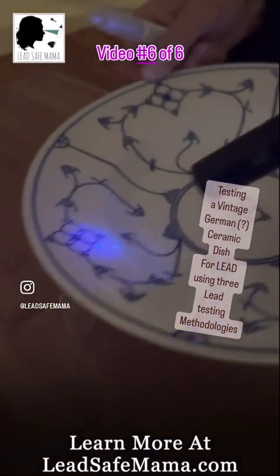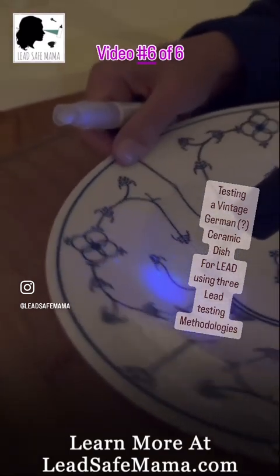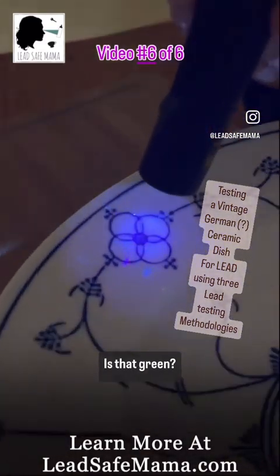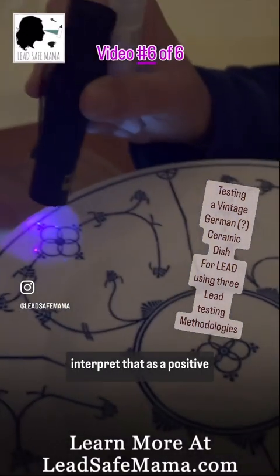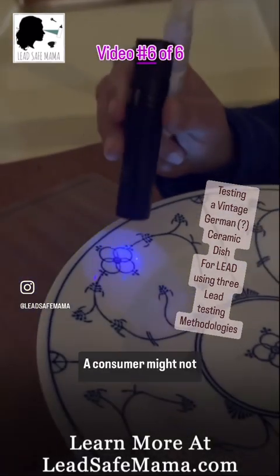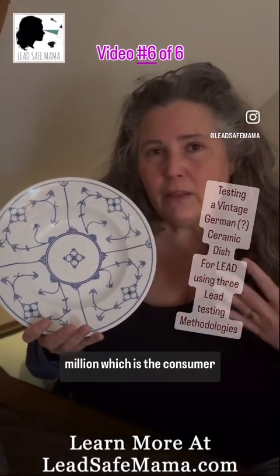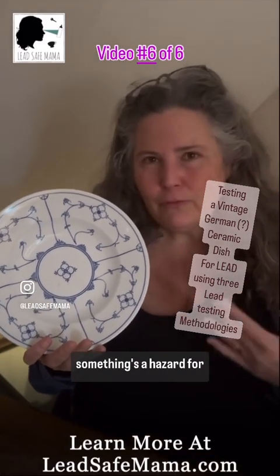Let's do one other spot — try the bottom, the other side. This already has little blue glowing bits, but no green. Are those green? It might be a little bit of green — it's hard to say. Either way, I wouldn't interpret that as a positive result as a consumer. It does have lead at a safe level, below 90 parts per million, which is the Consumer Product Safety Commission level to determine if something is a hazard for children. But the thing it's not telling you is that it has cobalt.